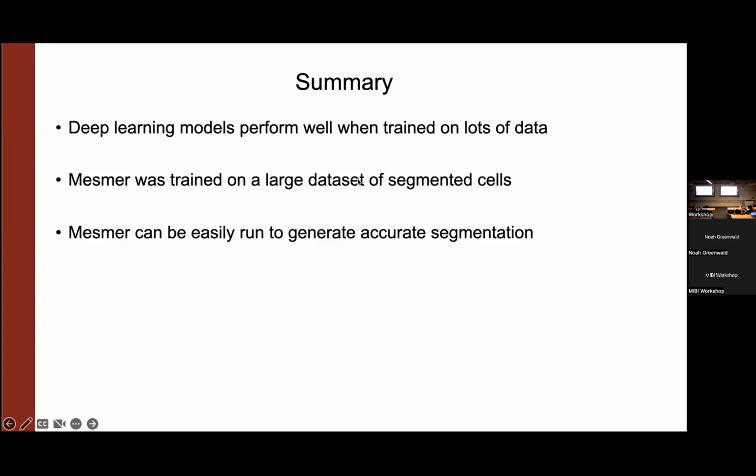Noah, just to clarify, you're saying that you run the whole image through Mesmer, and then in your cell table with the cell segments, you have a binary column demarcating whether they're within some kind of necrosis? Yeah, exactly. So Mike was clarifying that we don't mask before segmentation. We do everything normally, the whole segmentation pipeline, but then after the fact, the output is a cell table, and on that cell table, we will generate a mask that says this came from a necrotic region. So we don't have to change our pre-processing. It's just the post-processing that gets changed.